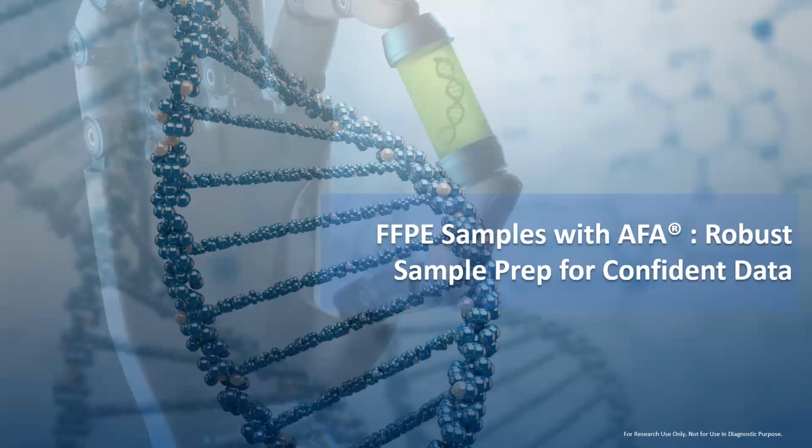But the main goal over here is to actually tell you what AFA is, which stands for Adaptive Focused Acoustics. There won't be a quiz after this, so don't worry about me asking the full form of AFA, as long as you remember AFA. So Adaptive Focused Acoustics and working with FFPE samples.